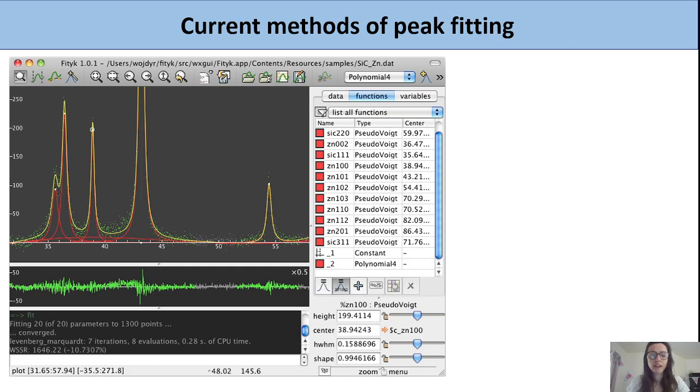At the moment, people fit their Raman data in a wide variety of ways. One option is Fitic, which is an open-source tool. What you basically have to do is click along and select the baseline and drag peaks in.